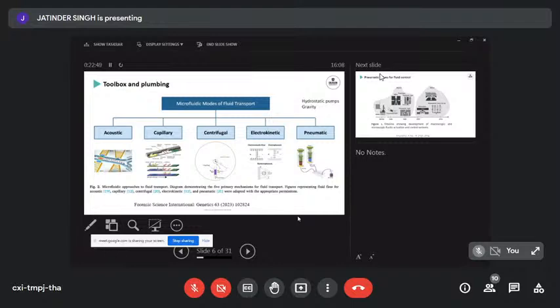And then there's the pneumatic systems where, as I just showed you, they give very nice smooth flow. We have a reservoir. We control the pressure of the air sitting above the liquid. We have a tube sitting down in the bottom of the liquid. And depending on the pressure that we apply above the liquid, we get a flow through the tubing. So you can see those sitting there.